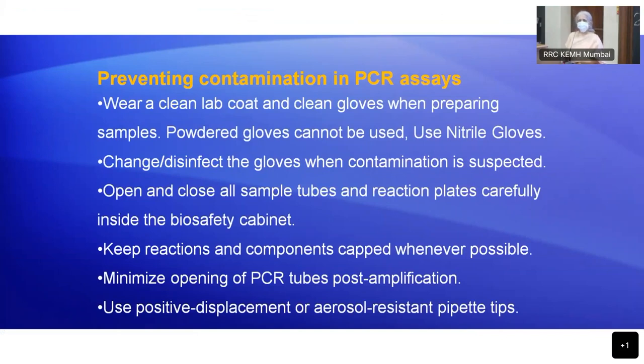This is what you do every day, but at the end of the day, it might be different. If you get a report in a biochemistry lab, you finish your work and hang the coat in some room. With PCR, that's not allowed. It has to be fresh, it has to be clean on every single day. And you cannot move the same lab coat and gloves from one lab to the other. If you are forced to move from a dirty to a clean area, you change everything and go with fresh protective equipment, not the same.